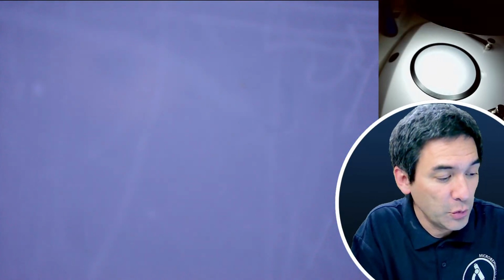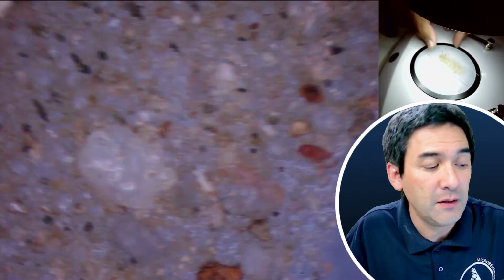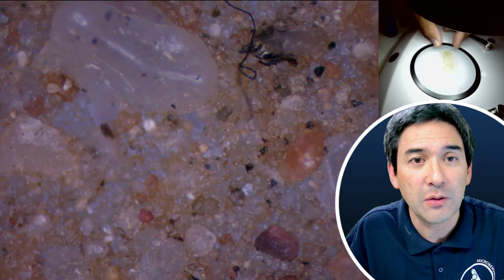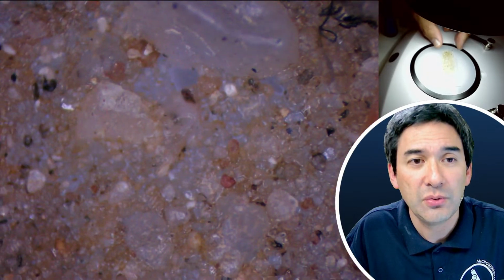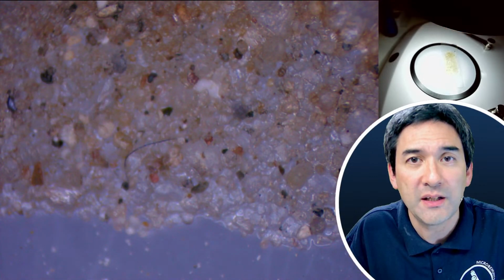I'd be only worried if the material is decomposing and if the bacterial count goes up quite a bit. So that is the one thing. Let me show you, before we start making some slides here, the other one over here, where I basically glued it directly on the slide. You can see that because the glue kind of surrounds the sand grains, the individual sand grains are not quite as visible.